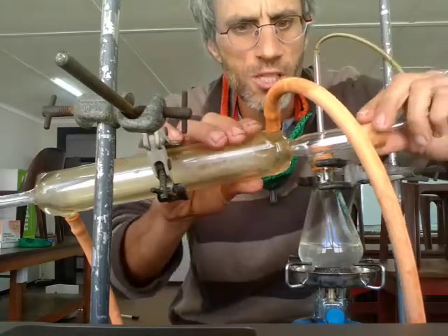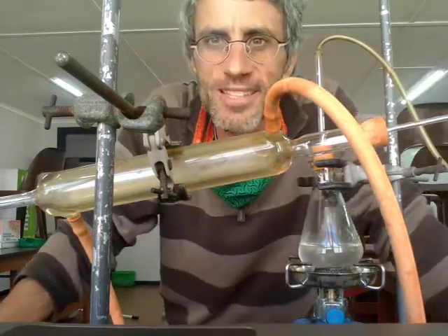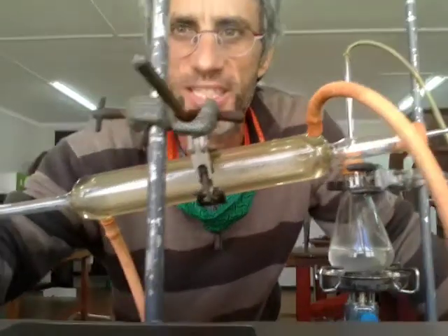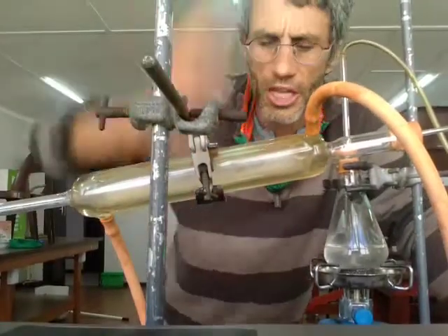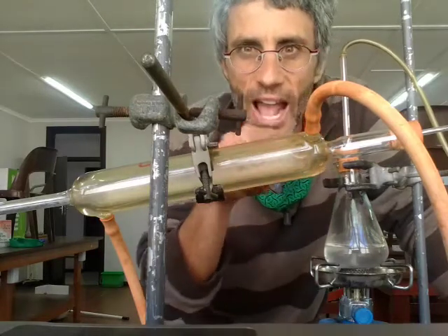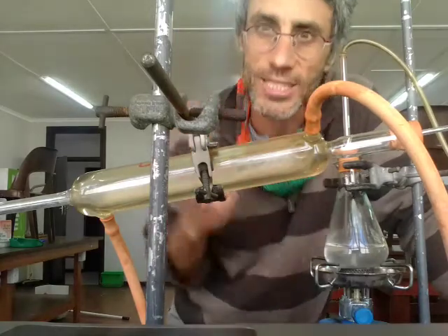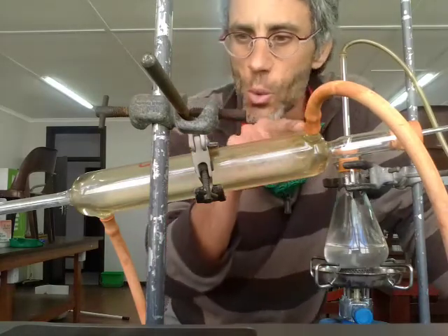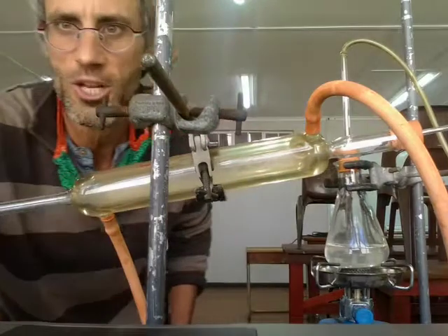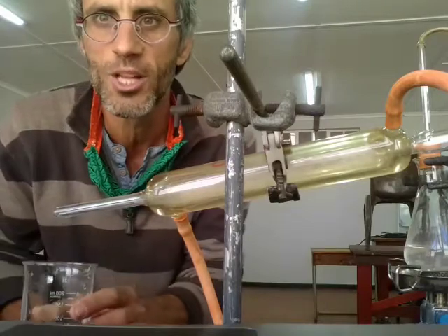And it will go over to this gadget, which we call a Liebig condenser. Say it again, Liebig condenser. What is this Liebig condenser? Or we can just call it a condenser. The condenser, as its name suggests, condenses the vapor, because we're going to have water vapor going through this condenser. We want to condense it back to liquid water. So we need to cool the water vapor. It will go through it, cool down, and eventually will drip from here into our beaker. And hopefully here we'll collect some pure water.